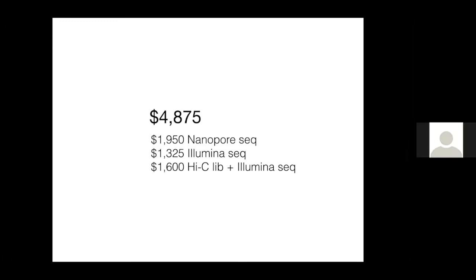I have a question. Yes. How difficult would it be to make chromosome level sequencing, like what you have, instead of scaffolds, chromosome level quality? Right. So you want to have some pretty good assembly to begin with.